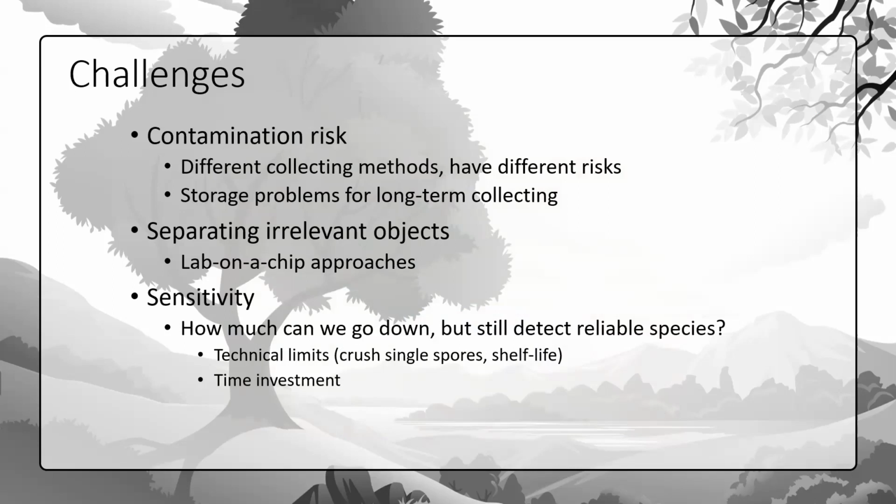Then we have, maybe not always, sometimes you don't care about separating all the residue that you are not interested in. But if you do care, there is, of course, this lab-on-a-chip approach that I want to establish, to filter out certain kinds of dirt particles, or even separate certain sizes of spores. It would be interesting to use this for the parasite that we now find, the myxos.